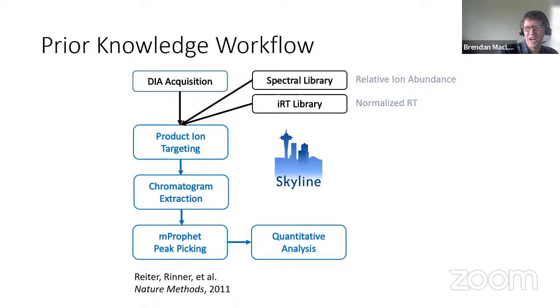No, they don't. The collision energy is a little bit sloppy, as long as you're getting things in the right range. What people tend to do with their DIA, or at least the McCoss lab is definitely doing this, is when we acquire a range of DIA, we use the optimal collision energy for charge 2 of the center of that window. And that ends up being pretty good.